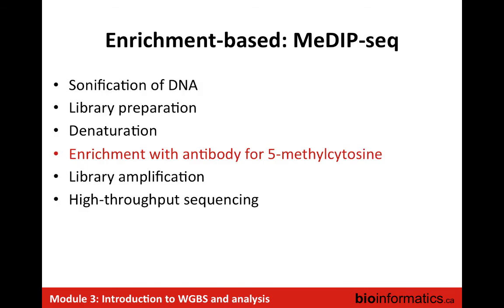So moving on from the microarray-based approaches to some of the enrichment-based approaches. Again, many of the steps are similar. Here, there's no bisulfite treatment. The main difference after the sonication of DNA and the library preparation is an enrichment with an antibody that recognizes this 5-methylcytosine. This is what Misha was talking about yesterday, the equivalent of ChIP-seq on the histone marks, but where you're pulling down, using an antibody, DNA that's methylated in this way. And then the downstream analysis is quite similar to what you saw yesterday.